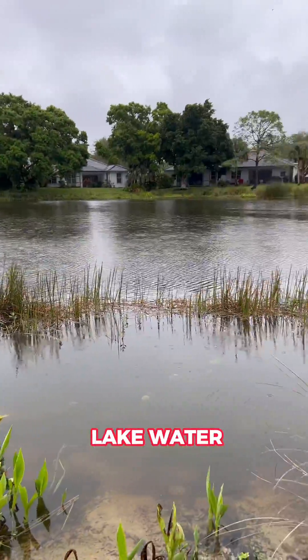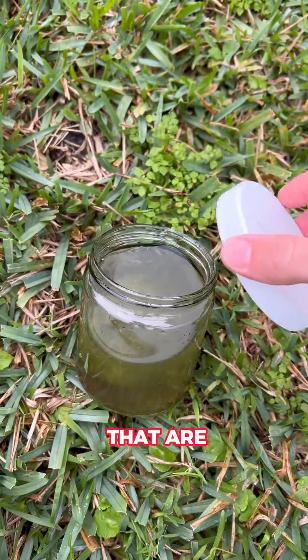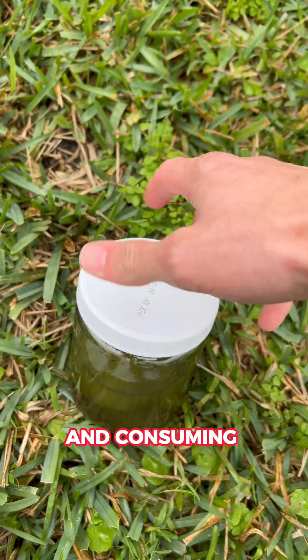This is why you should never drink lake water. This kind of water holds a plethora of microorganisms that are impossible to see with the naked eye. And consuming this water can make you extremely sick.